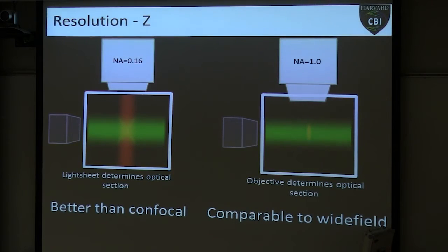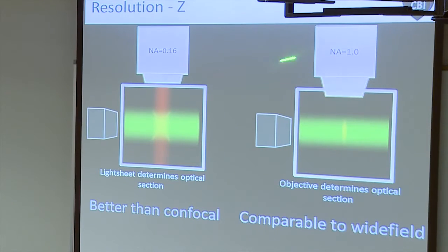So if we go back to this diagram again, and we plug in point spread functions for these imaging objectives, or the ones that are collecting the fluorescence, that are relative to their actual numerical apertures, what we see here is we have our light sheet coming out of this objective, and it's going to be the same in both of these examples, but the point spread function of this imaging objective is much different. Okay? So this is actually not even the full point spread function. I've chopped it off just to make it fit in the image.